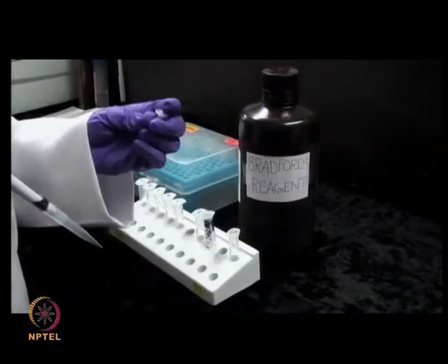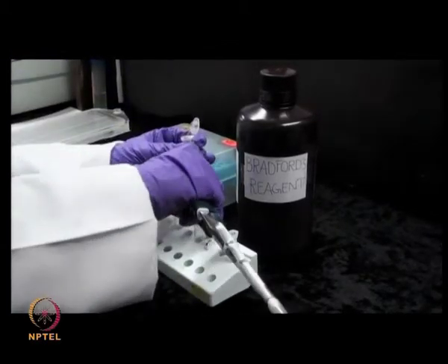Then add the Bradford color reagent to each tube and mix well.